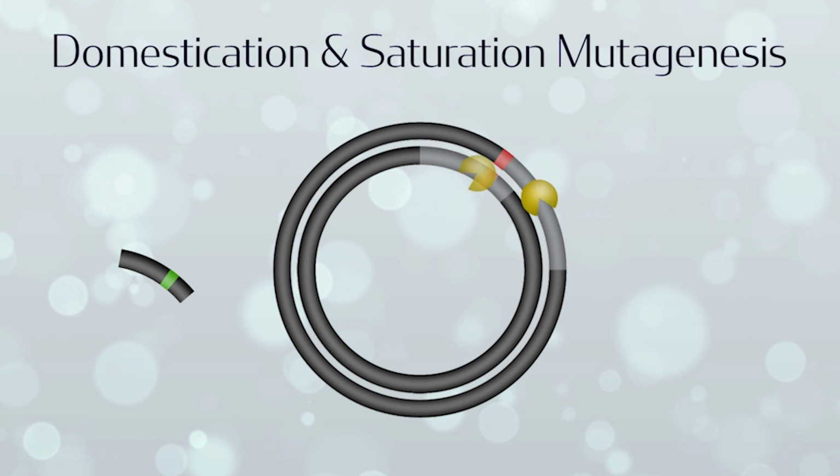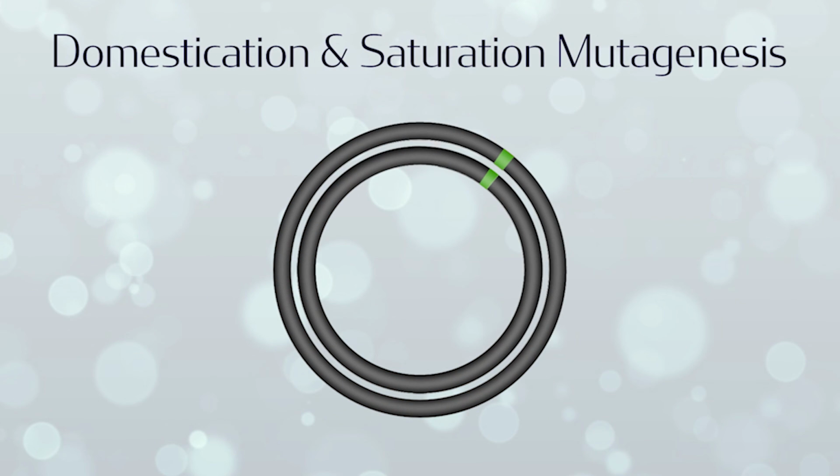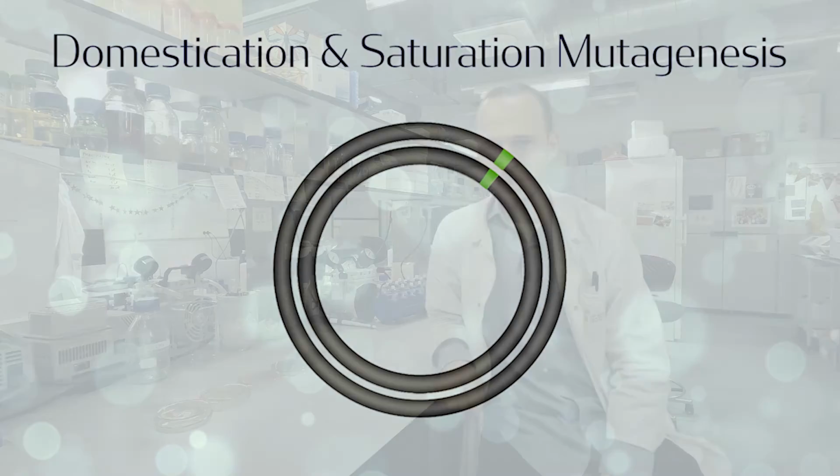The 5' exonuclease chews back the 5' ends of the vector backbone so the oligo can anneal. Afterwards, the DNA polymerase fills up the nucleotide gaps and the DNA ligase seals the nick. The result is a mutagenized part in the desired backbone.